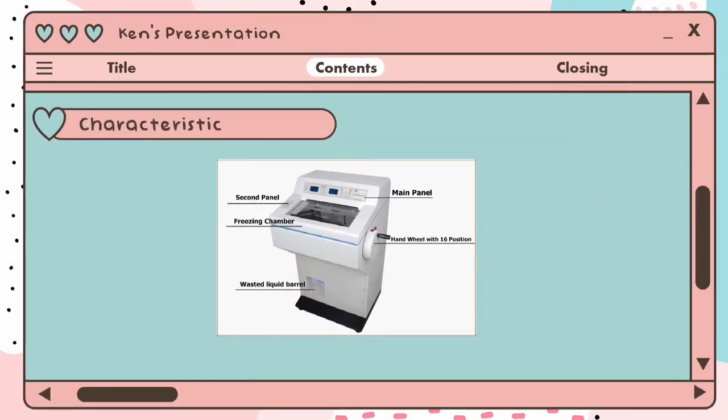Now I'll be explaining about the characteristics. The cryostat has a main panel, a hand-wheel with 16 positions, a second panel, a freezing chamber, and also a waste liquid barrel.